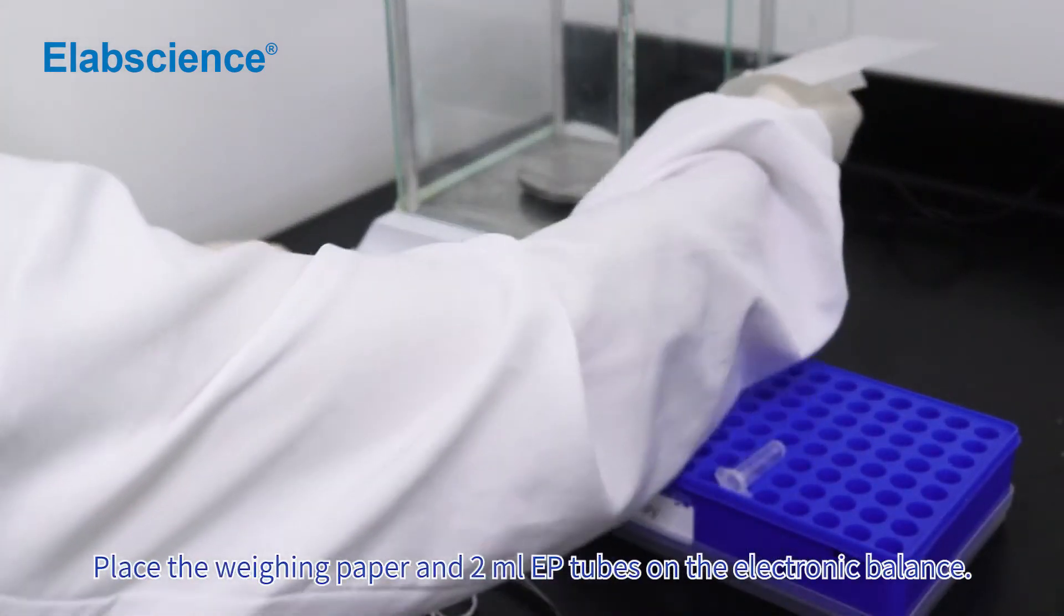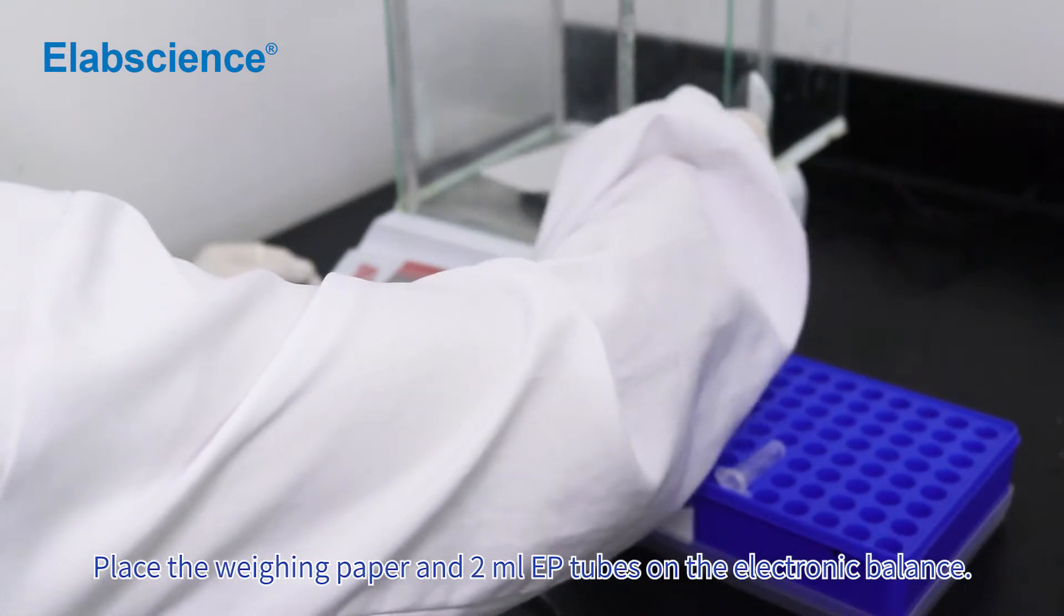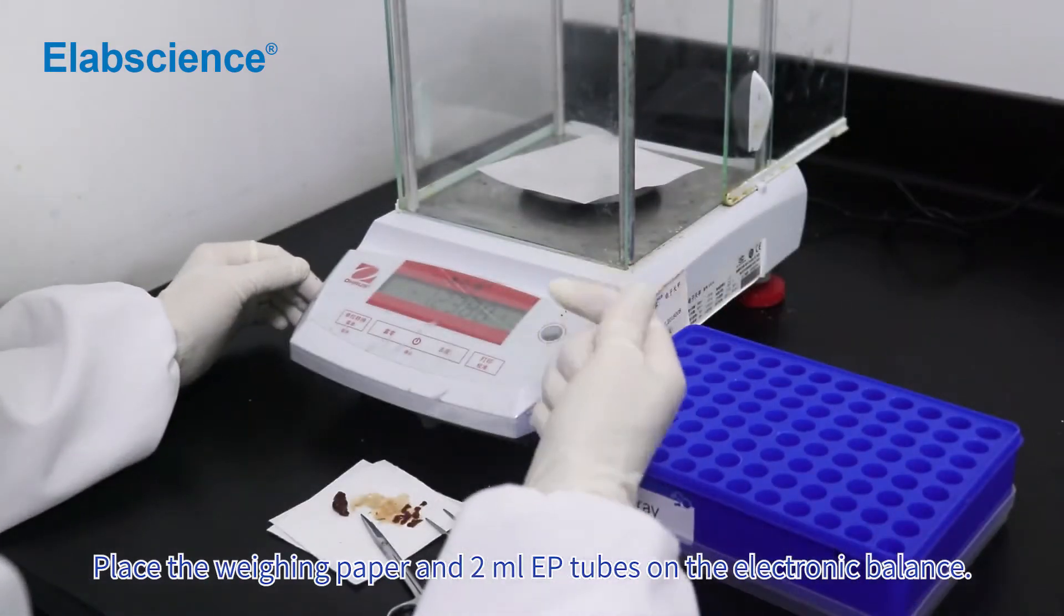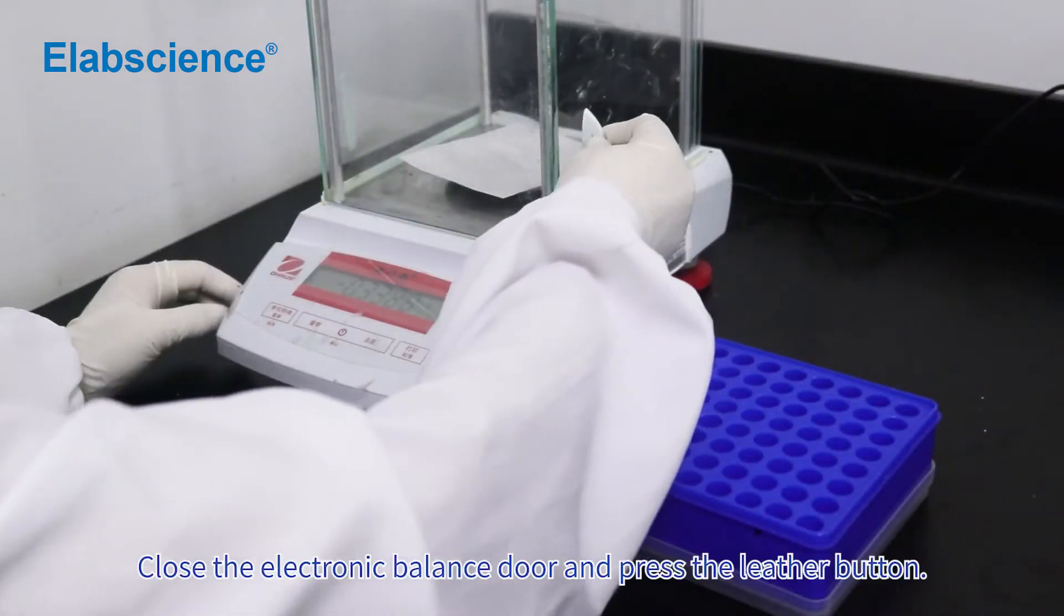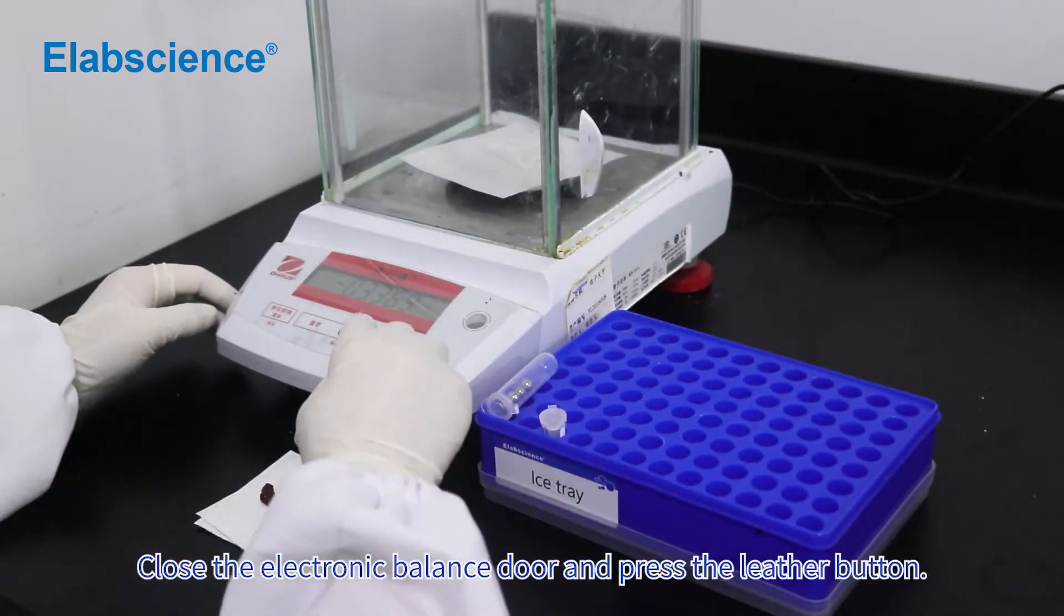Place the weighing paper and two milliliter EP tubes on the electronic balance. Close the electronic balance door and press the tare button.